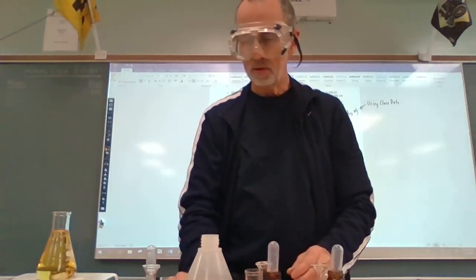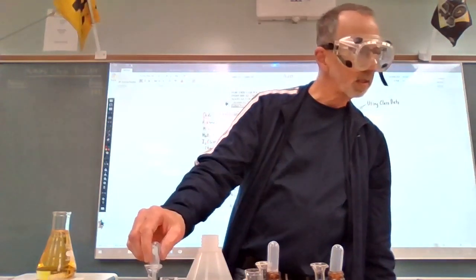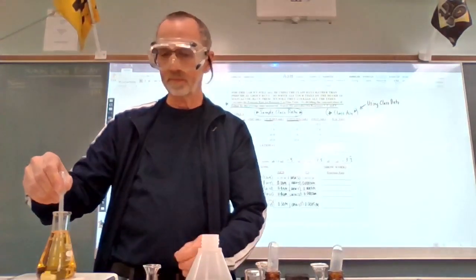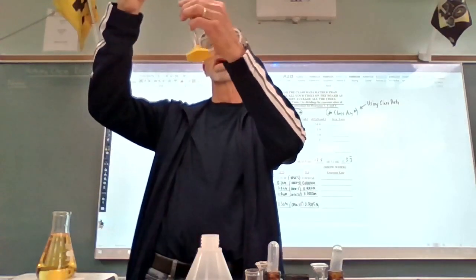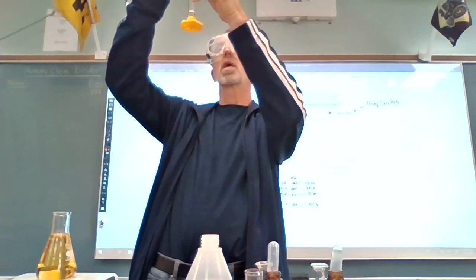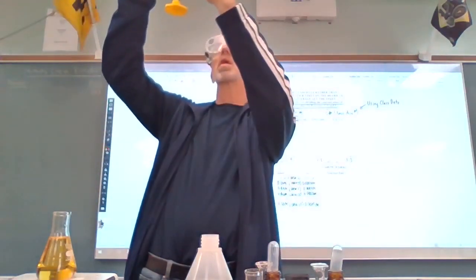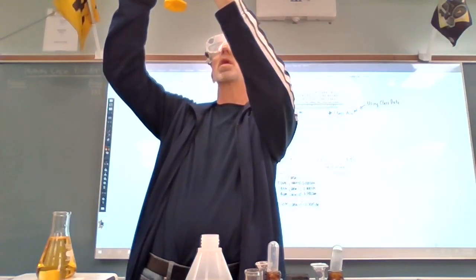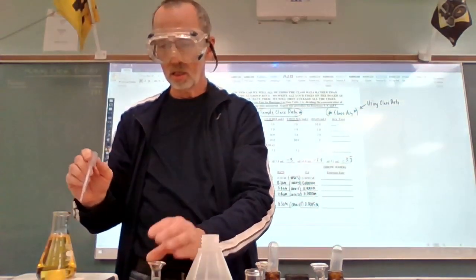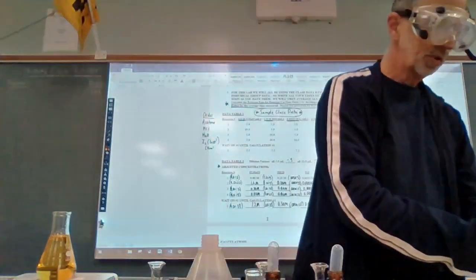And then I'm going to need 5 mLs, yes, of iodine. I'm going to get this old stopwatch ready here.